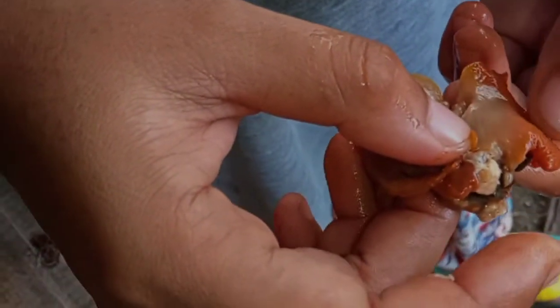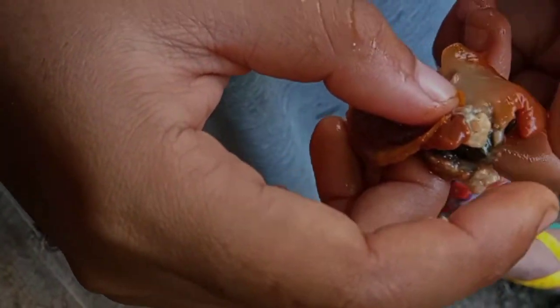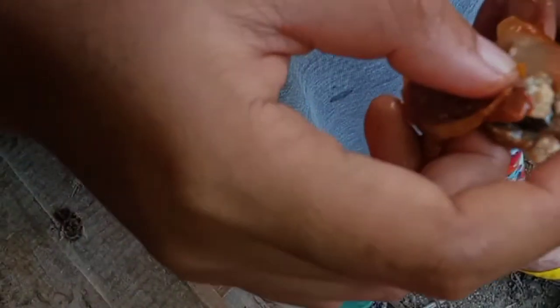In scallops and mussels, it is much reduced and may have little function in adults, both in the larval and juvenile stages. It is important and is used for locomotion. This is important in species such as mussels and some scallops, enabling the animal to anchor itself in position.